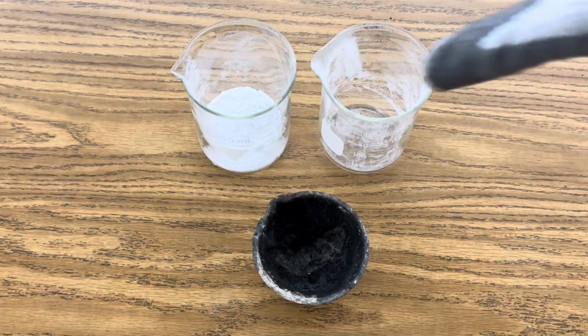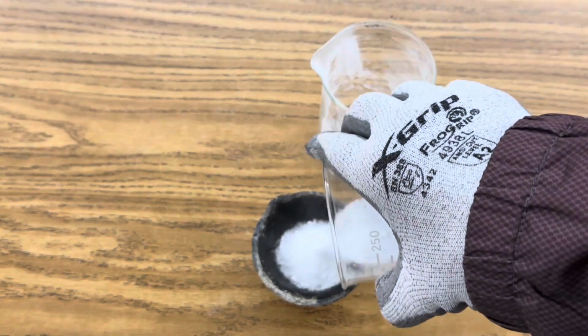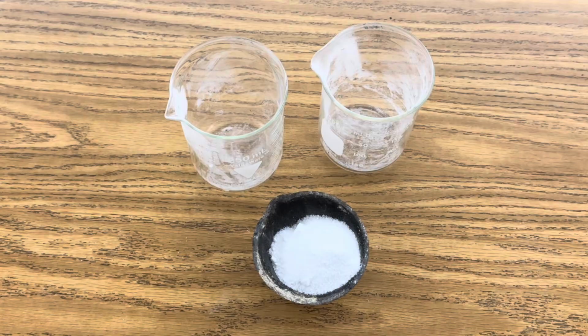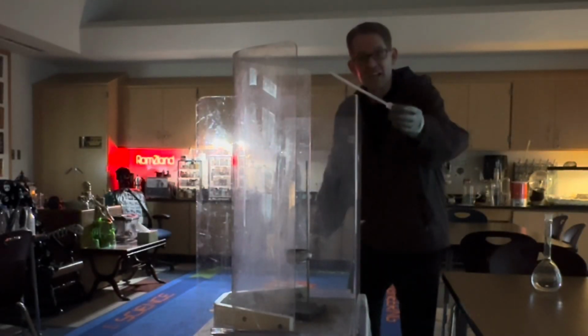Then when your mixture is ready, I'm going to pour it into my ceramic crucible, put it on a ring stand, and catalyze it with a drop of 18 molar sulfuric acid, and hopefully we'll get a nice bright red flare. Okay, now we're ready to add the sulfuric acid. Here we go.